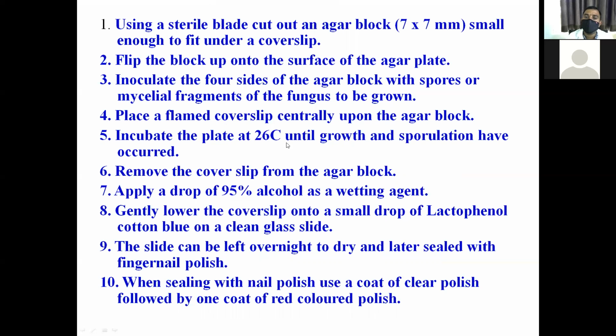Then incubate the plate at 26 degrees centigrade until growth and sporulation have occurred, usually 48 hours. After 48 hours, you will see growth. For microscopical examination, remove the cover slip from the agar block. Apply a drop of 95% alcohol as a wetting agent.